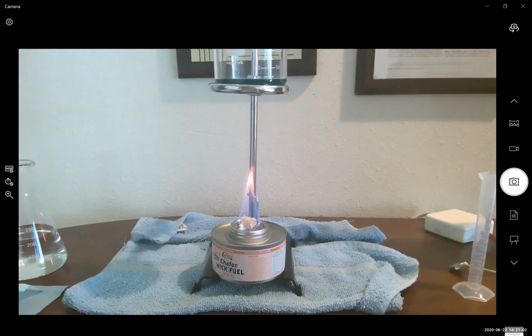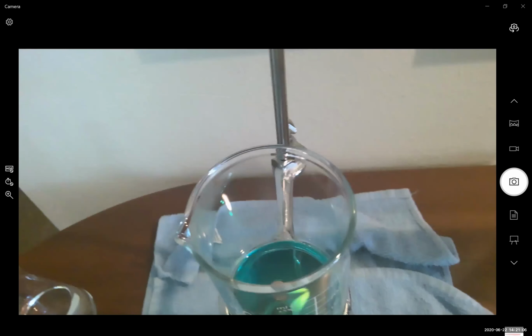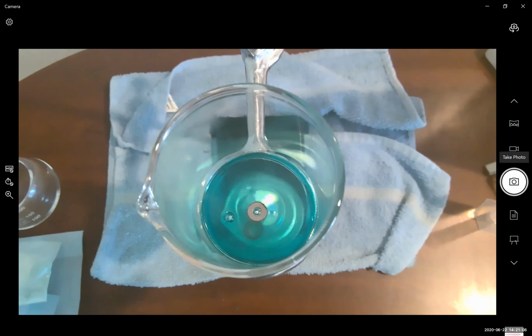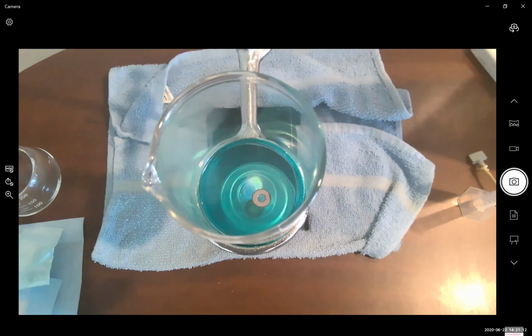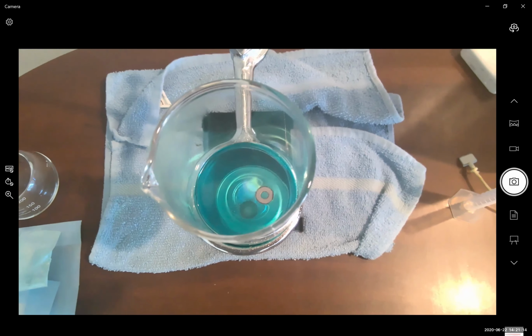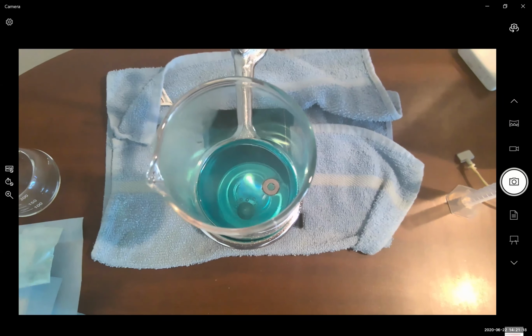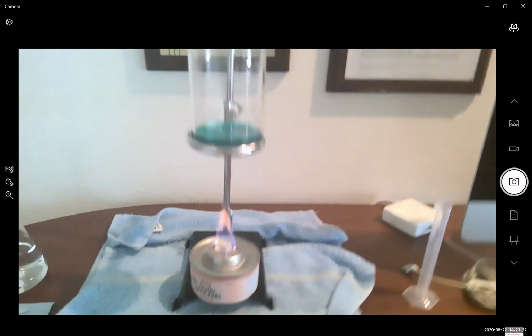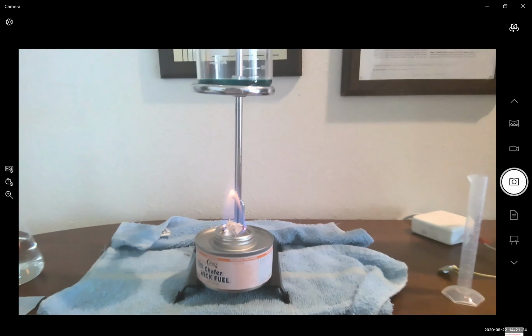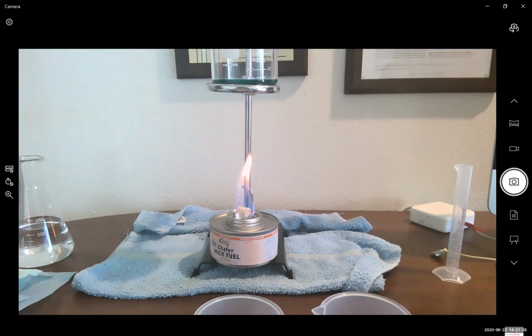And let's take a look. We're actually seeing something really cool. Does everyone see how one of the washers is really disappearing now? Yep, it's reacting. This reaction often requires a solution to reach a target temperature before it really gets going.